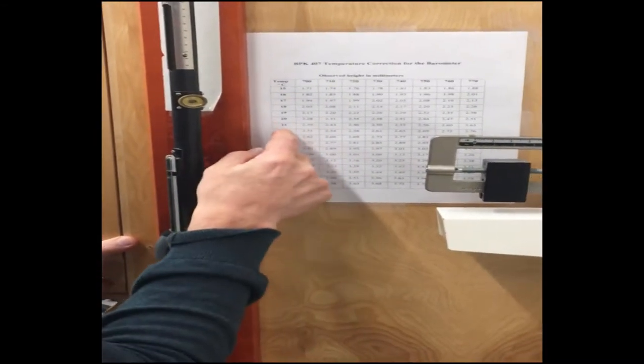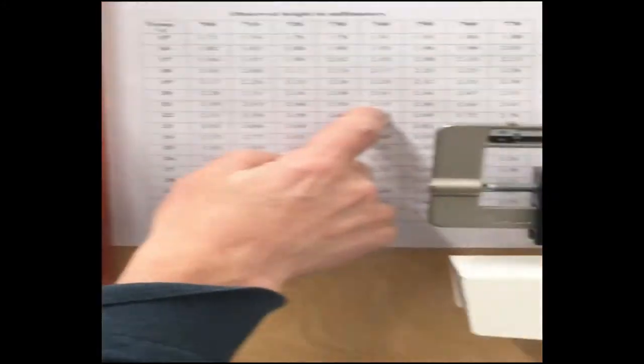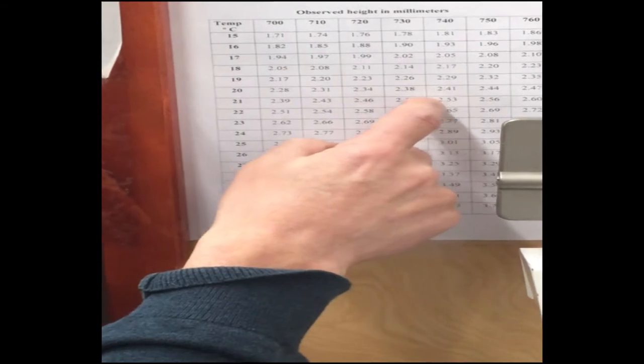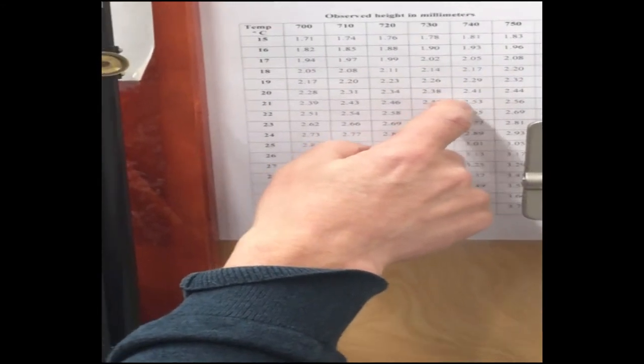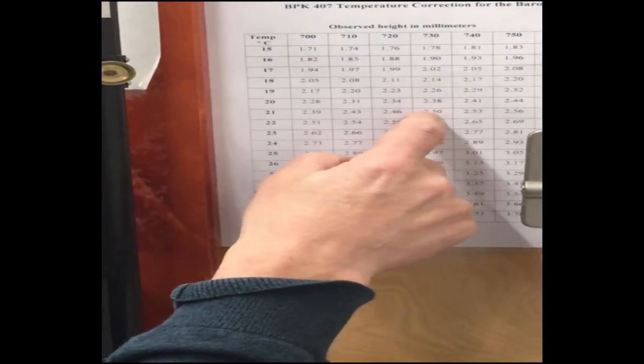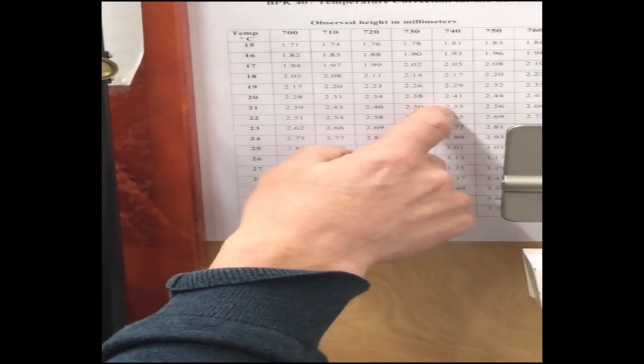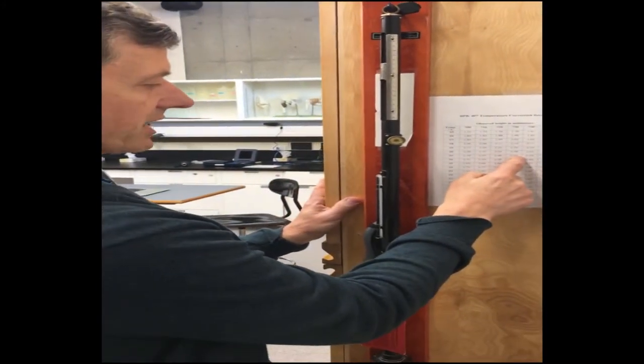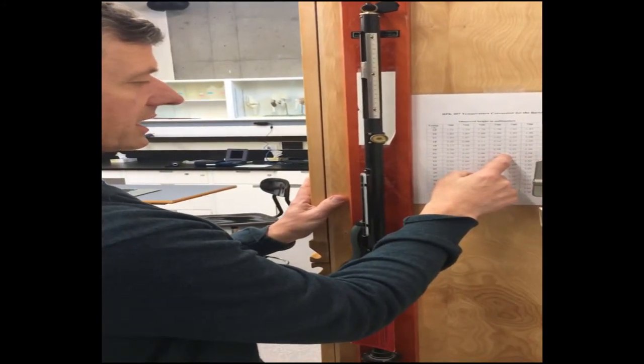I know that the room temperature right now is 21 degrees Celsius. I know that we're just below 740 millimeters of mercury - we're between 730 and 740 millimeters of mercury. If I was to interpolate, the number would probably be about 2.52. This is only good to one decimal point, so when you take your correction factor you only want that to be to one decimal point.